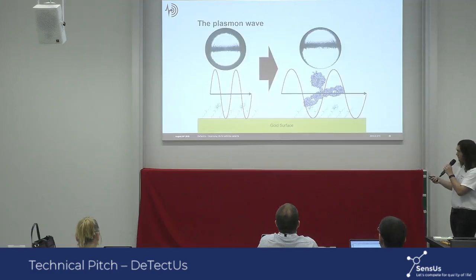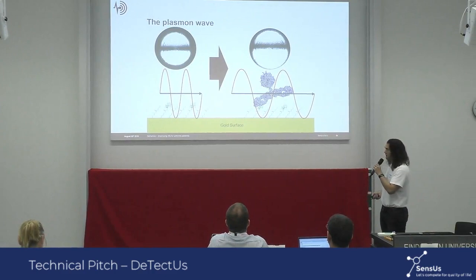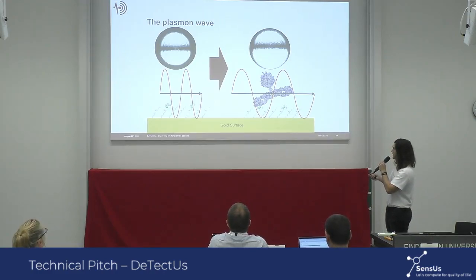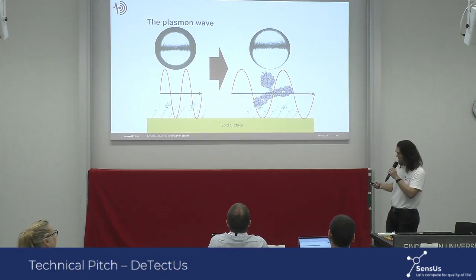So when the plasmon wave is created, it propagates along the surface of the metal, and it can only be resonantly excited if the momentum of the incoming light matches that of the plasmons. And that is why it's called surface plasmon resonance and why we require very specific angles for this excitation. So depending on what is on top of the surface, different angles will be required. Thus, by detecting the change in the placement of the dark line, we can detect the change in what is on top of the surface, in other words, adalimumab.